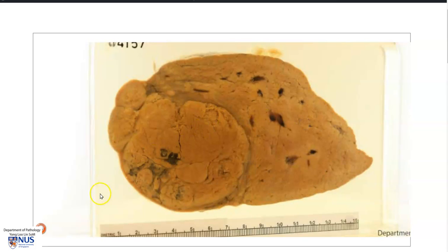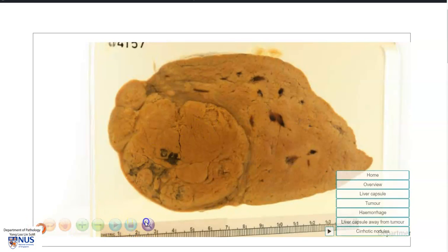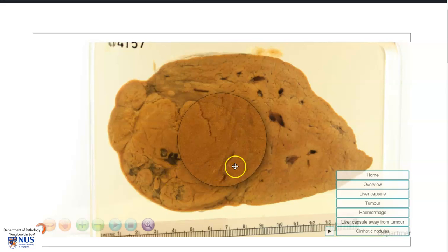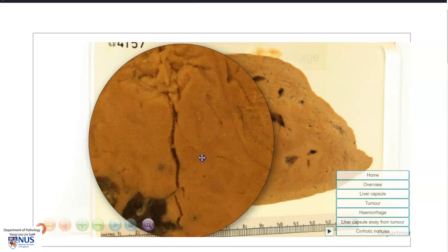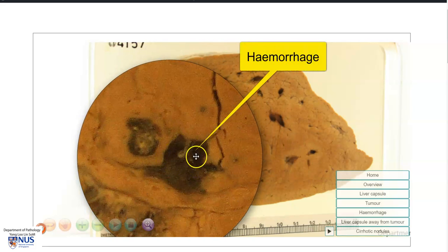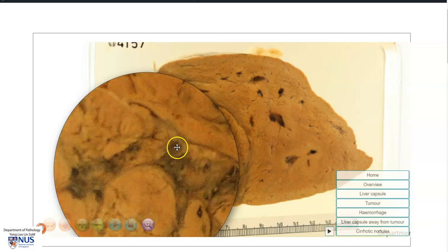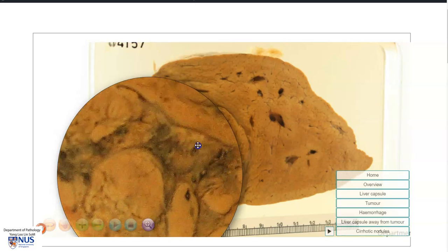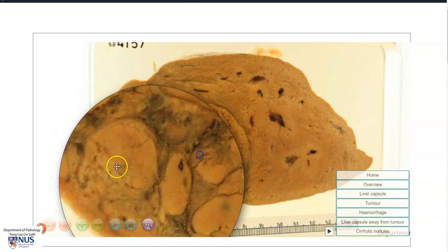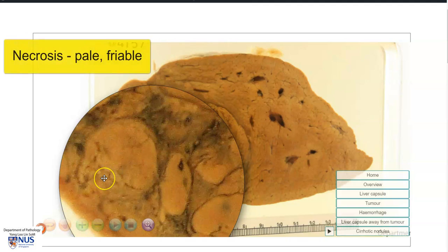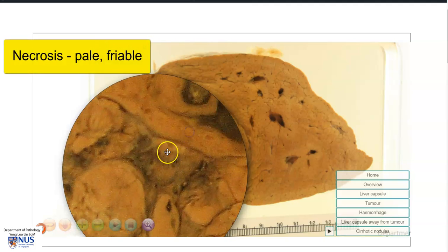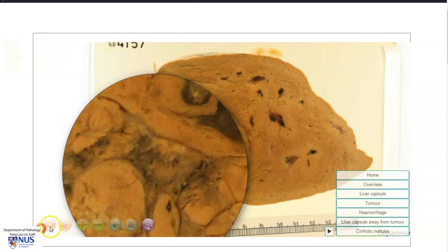Looking carefully at the mass, we can observe that there are some areas of blackish hemorrhage, and there are also some paler areas here and here, which appear a little bit friable or breaking apart, and these pale areas represent foci of necrosis.